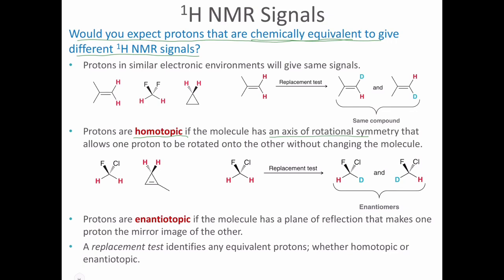And when we interchange the protons, we don't see any difference. Then it means that they are actually in a similar environment. For example, in this case, we can rotate this, and we can call this proton A and B. When we rotate it, those protons will interchange, but we can't really tell the difference between A and B when we do that interchange.